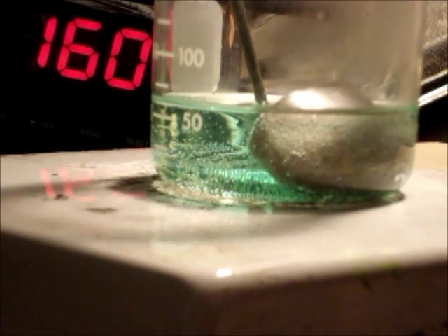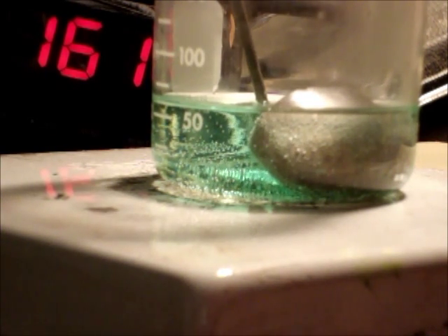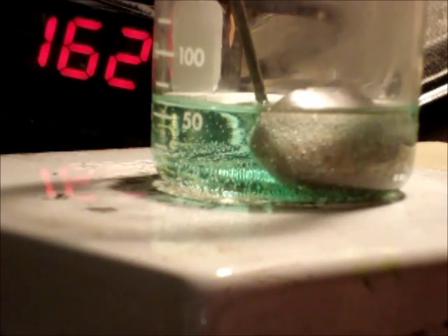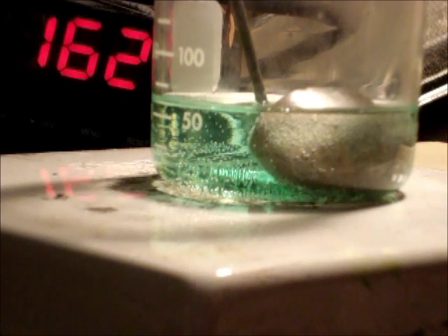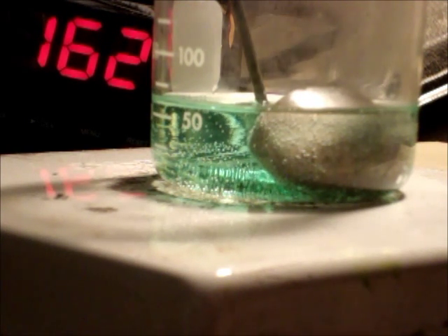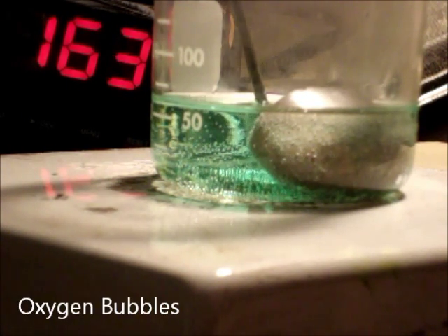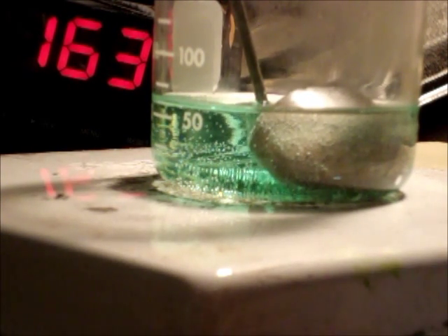Okay, we got 160 Fahrenheit, nickel briquette, and some unknown concentration of nitric acid, probably 50%. That's my guess. Maybe 40. Anyway, the solution's heating up right now. It's just sort of degassing. It's been sitting outside for a while, so it's probably oxygen bubbles coming off. Anyway, we're going to watch the temperature rise and get back to it here in just a few minutes.